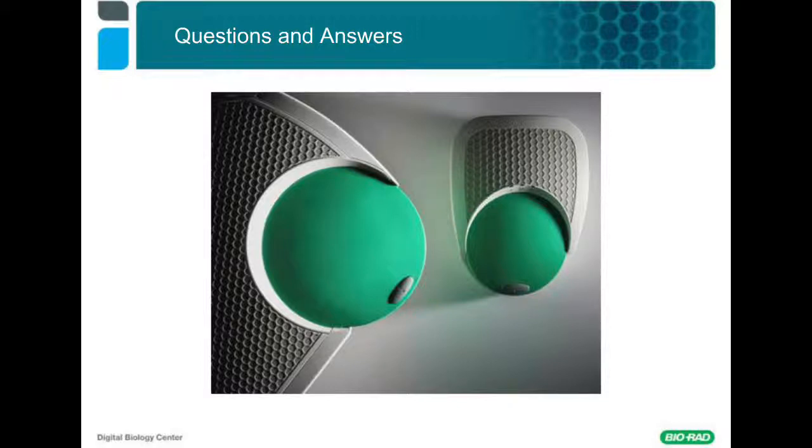Other known inhibitors that will definitely affect your results, yes. I would say anything that directly attacks or degrades the activity of the polymerase will affect also digital PCR. If you have, for instance, a phenol contamination or any type of chaotropic agent maybe that might denature the protein, that will definitely interfere with digital PCR results.